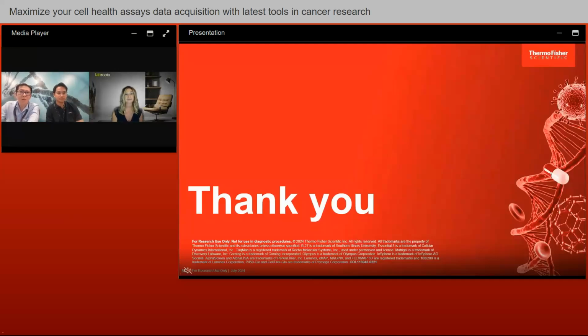I think I'll take that. For the M5000 StageView, we have been able to set up quite a number of pins. In the presentation you saw earlier, I added almost 100 pins in that map. Logically speaking, there is no limit that we are aware of, so you can add up to probably a couple of thousand. Depending on your applications, hopefully you do not need to identify so many locations in the 96 well plate. That would be quite a lot of work.